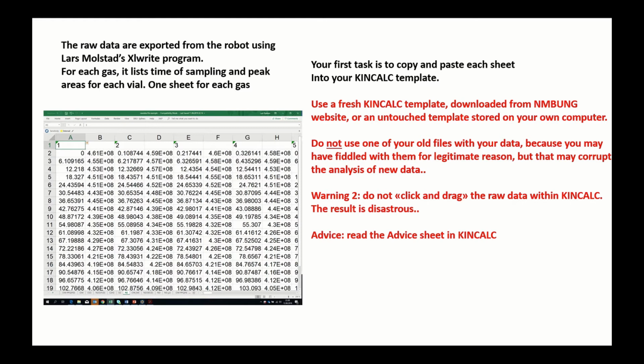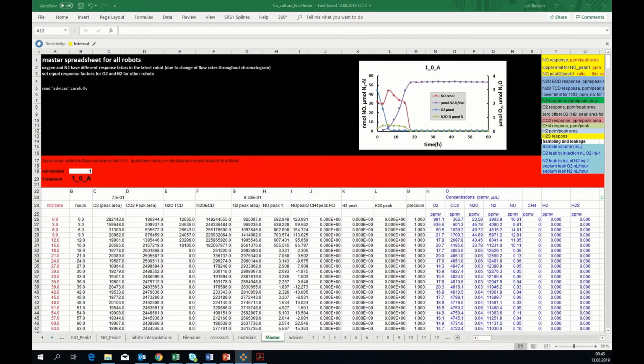Now to the structure and function, simply how it all works. To do that, we will have to plunge into a spreadsheet. The case we are inspecting is a co-culture of two denitrifying strains. I will not go much into detail about the experiment, neither interpret the result, but simply use it as an example to show how things work.